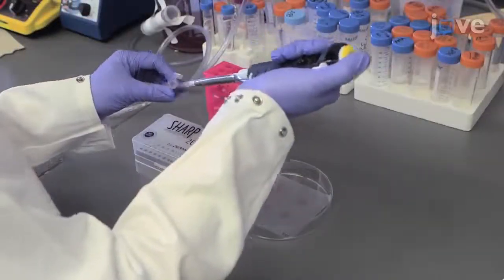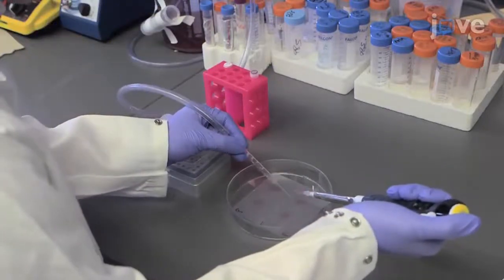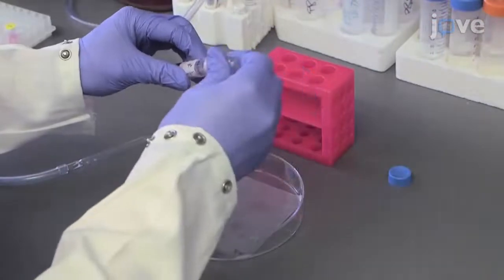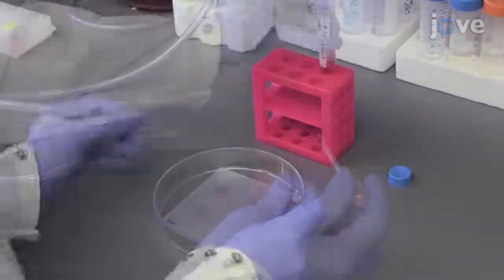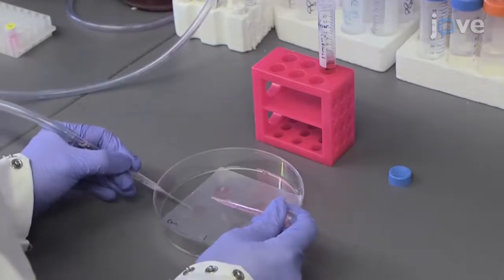Incubate the cells with primary antibodies diluted in conditioned media at room temperature for 15 minutes. After this, use a vacuum pipette to carefully aspirate off the antibody-containing media and wash the cells 3 times with conditioned media.